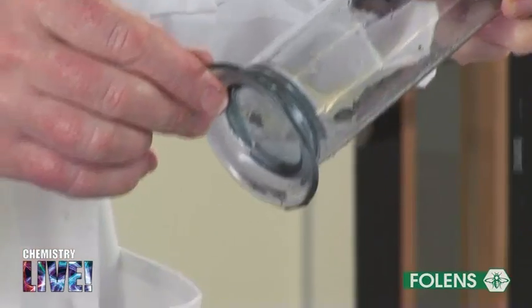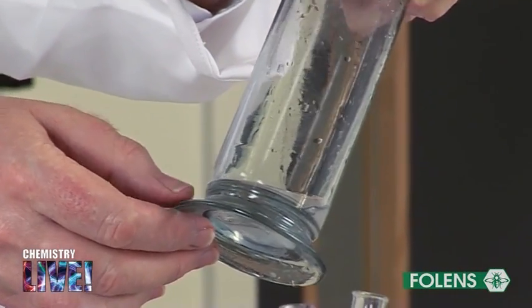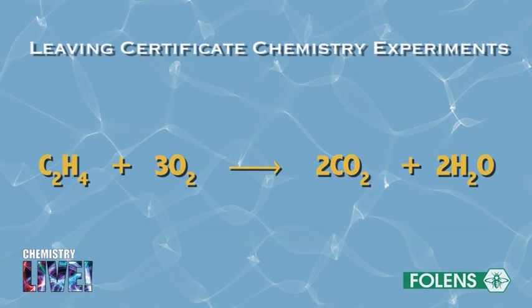The lime water turns milky, showing that carbon dioxide has been formed when ethene burns in air. Ethene burns to form carbon dioxide and water according to the equation shown on the screen. As a general rule, all organic compounds burn in air to form carbon dioxide and water.